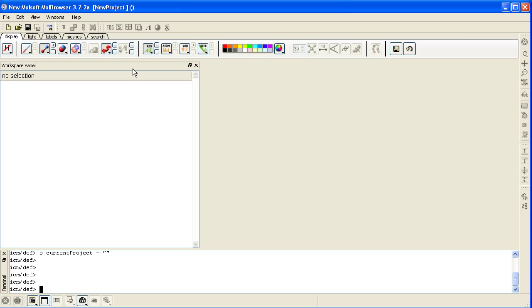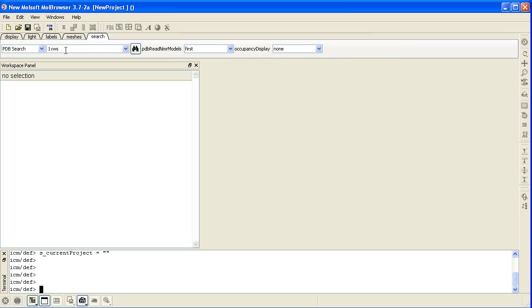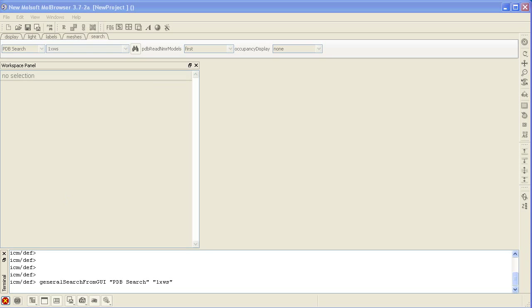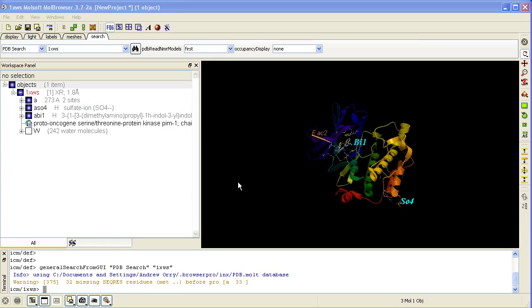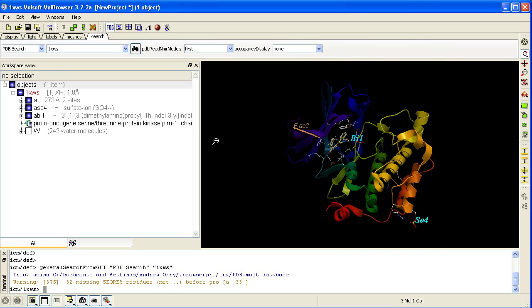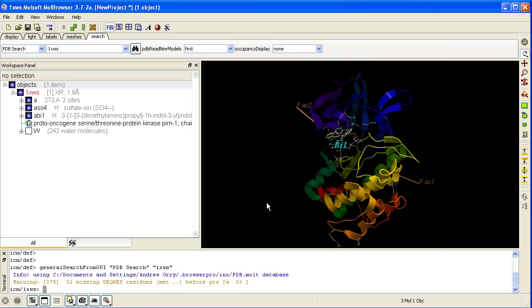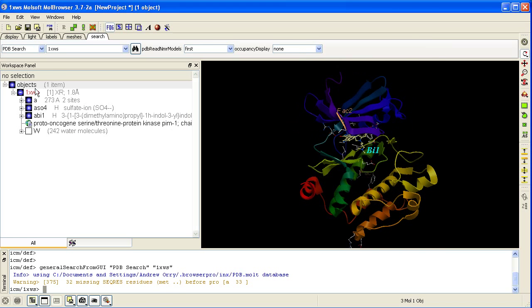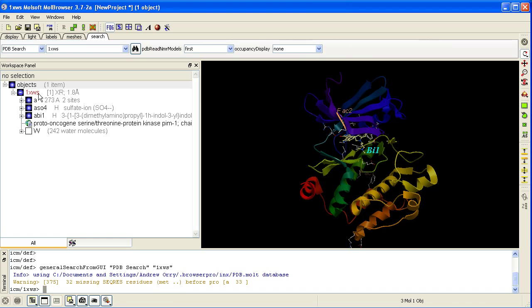In this example we will use the Kinase PIM1 with PDB code 1XWS. Go to the search tab, type the code and click this button here. Then you should see the structure displayed in the graphical display and also listed in the ICM workspace.